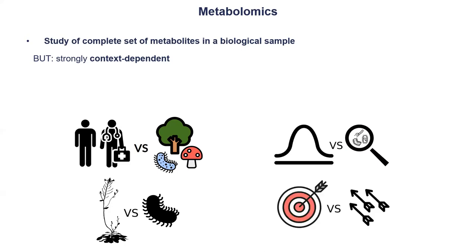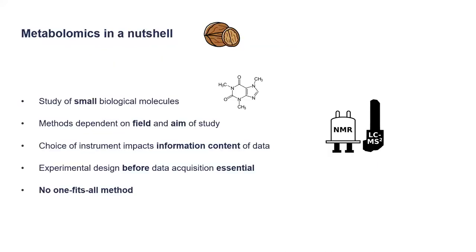Another thing, speaking about quantification, is whether it is targeted or non-targeted. In research such as prenatal screening, a lot of it is finding targets for a disease. If we find the target in the end, it's non-targeted, but once we find something, we can use it in a targeted way to search and screen, for example, a blood sample, as a targeted identification. This is also something we need to keep in mind. Metabolomics is already a very specific field, also sometimes called small molecules. So we are only focusing on a specific field or study.